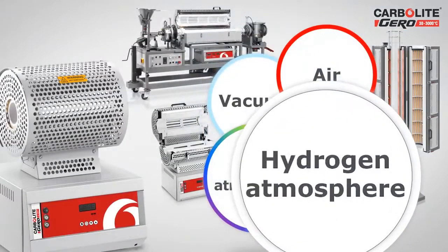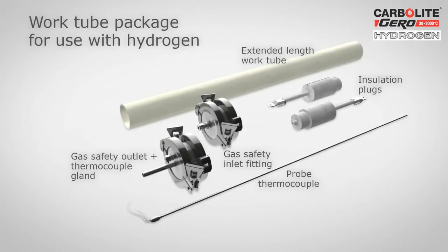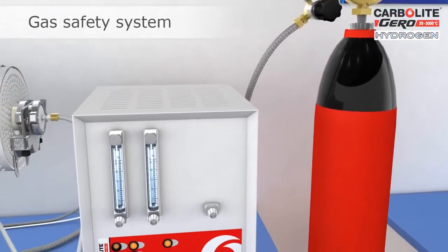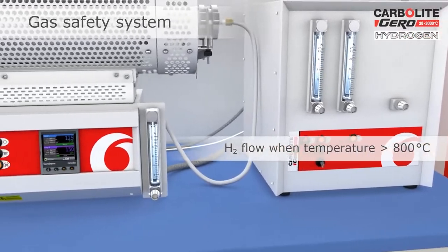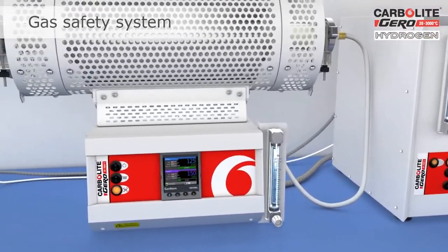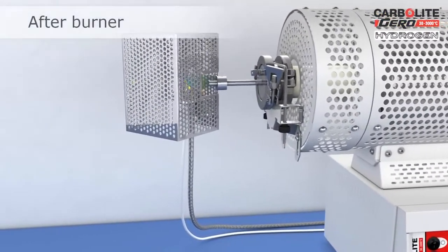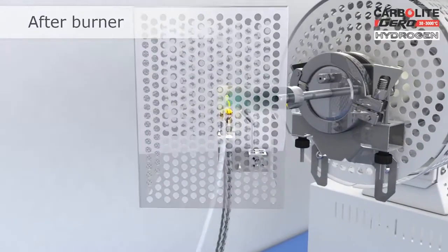For applications involving hydrogen, Carbolite Gero offers an additional gas safety system which can be attached to the tube furnace to safely control the gas flow. The gas safety system ensures a nitrogen purge and only allows the hydrogen to flow when the furnace temperature is above its auto-ignition temperature. An afterburner ensures that unburned hydrogen is combusted as it exits the work tube assembly.